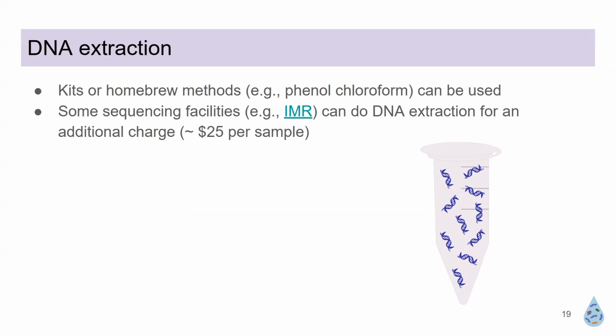The reason why we aimed for a kit in this particular case was that there was the right amount of biomass, which was very high, and there was a very high throughput, and of course, cost is a factor. The kits do cost more than a phenol chloroform extraction, but we had budgeted for that, to establish that consistency.